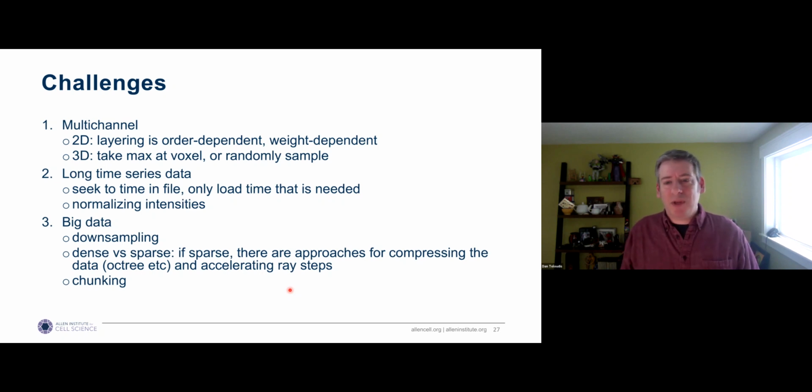However, the larger problem is when there are intensity fluctuations across the time sequence, and we want to write a script that can go through the whole time sequence and render out an image for each time. In order to actually try to normalize intensities across the whole time sequence, you effectively have to load and walk through all of the data in advance of even rendering it.